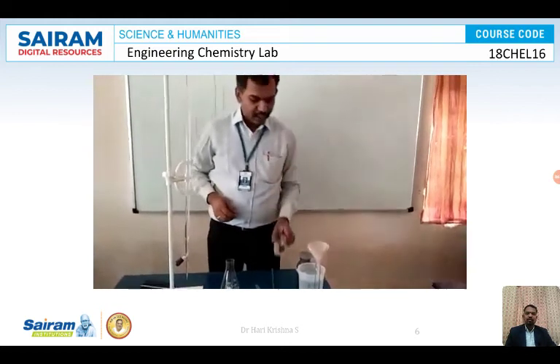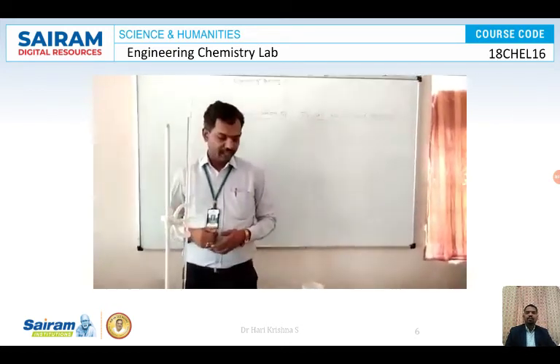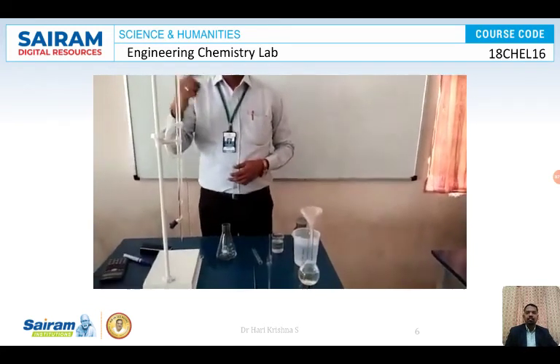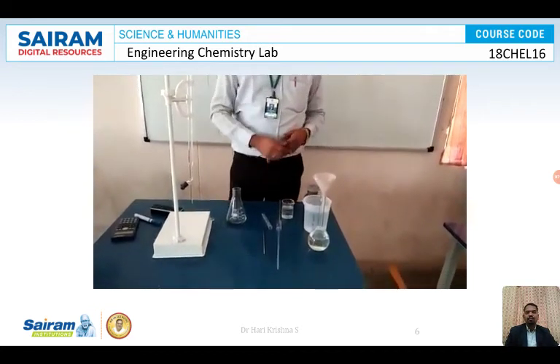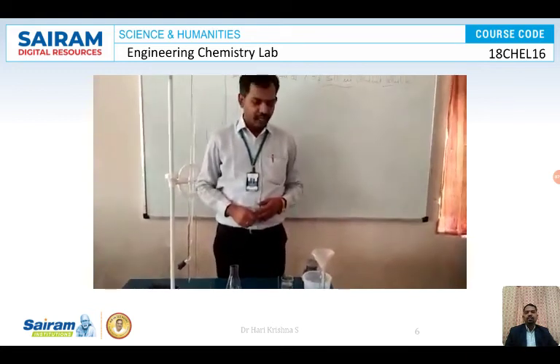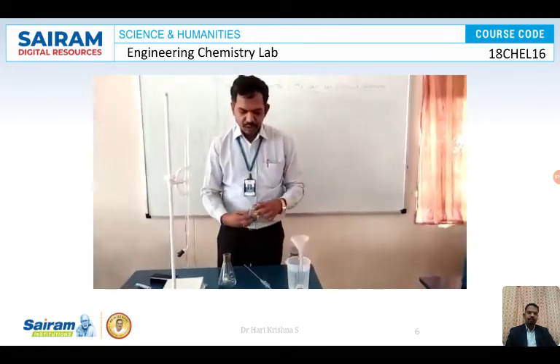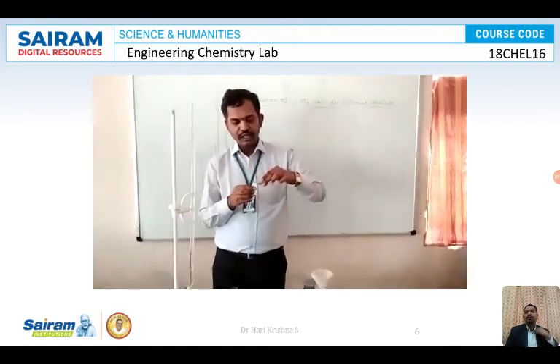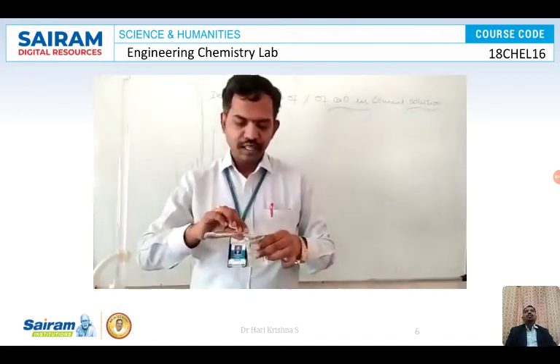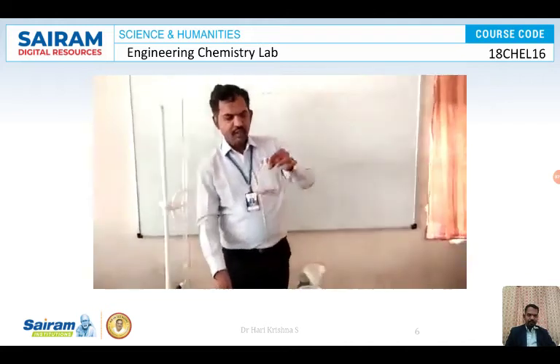NaOH is added in order to mask the magnesium ions from interfering in the titration, and it will allow only the calcium ions to react with Na2EDTA. Glycerol and diethylamine are also added. Glycerol is added to get a sharp endpoint, and diethylamine is added to act as a buffer. We will add half a test tube of this mixture of NaOH, glycerol and diethylamine to the 25 ml of cement solution.